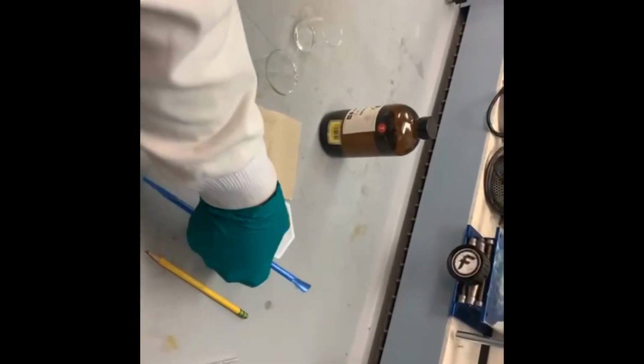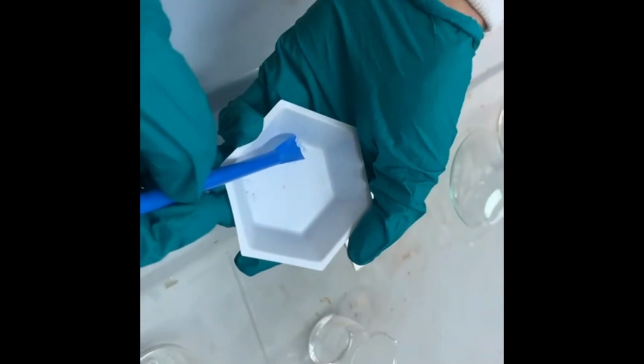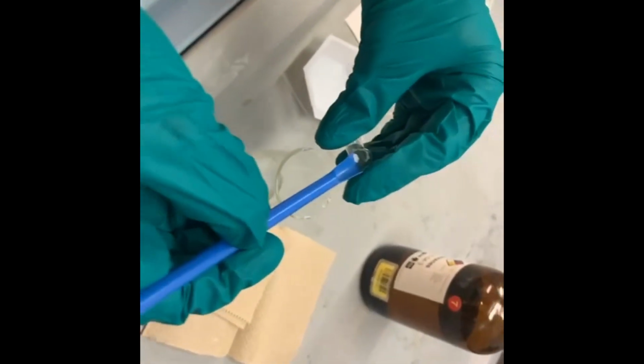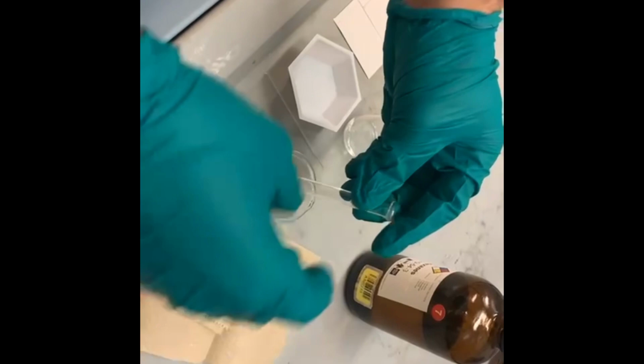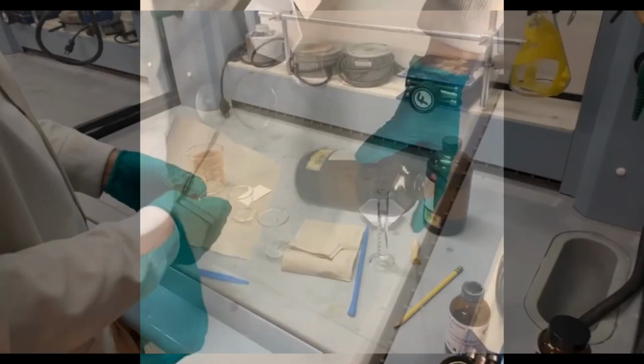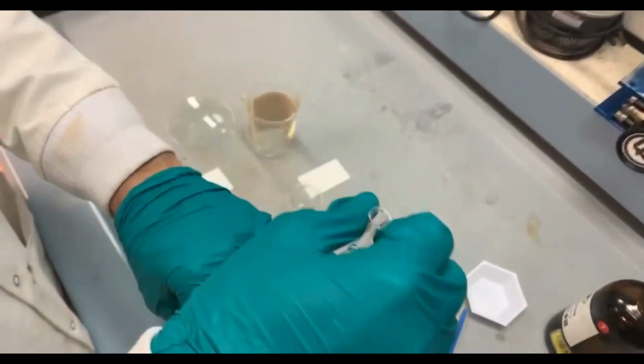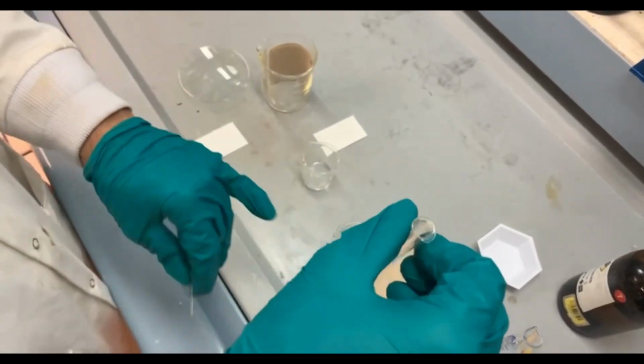And then what we're going to do is first we take a little bit of our compound and then you just need to make a very dilute solution of it, not concentrated. So we have a little bit of our sample here, and it's dissolved in a solvent right now.